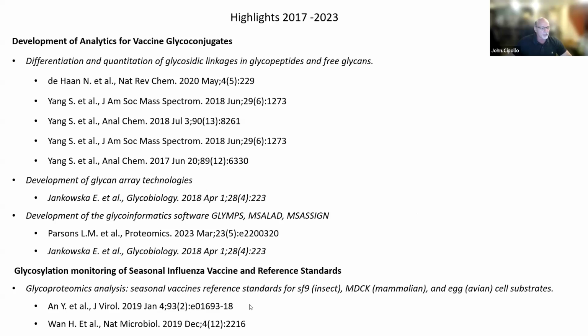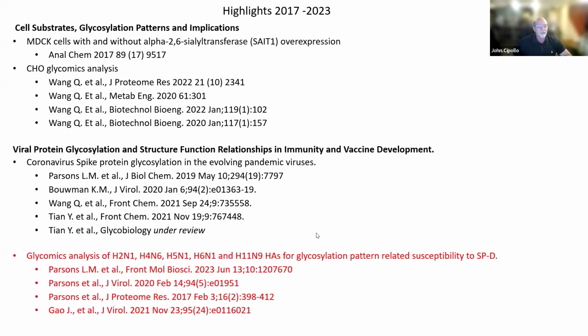As far as glycosylation monitoring of seasonal influenza, we looked at some of the reference standards, which are really representative of the antigens that go into the seasonal vaccine. We looked at a range of vaccines as well, to characterize glycosylation patterns on those. And then we looked at cell substrates.